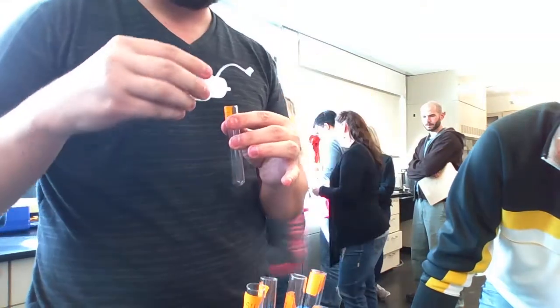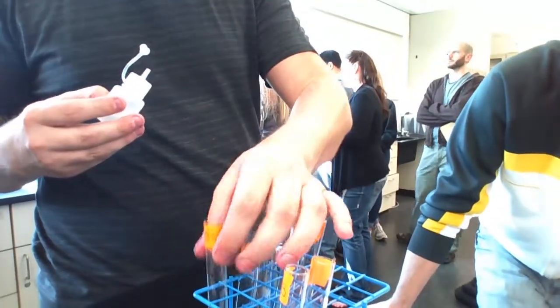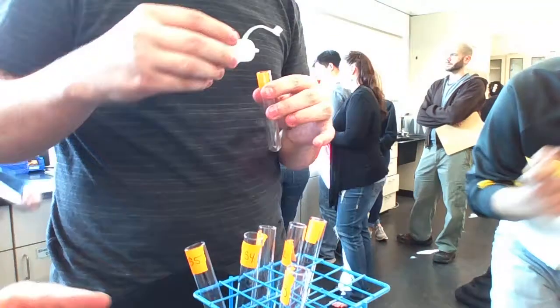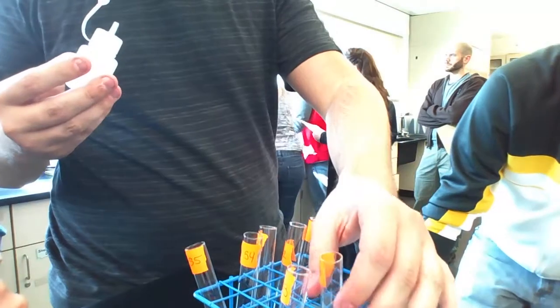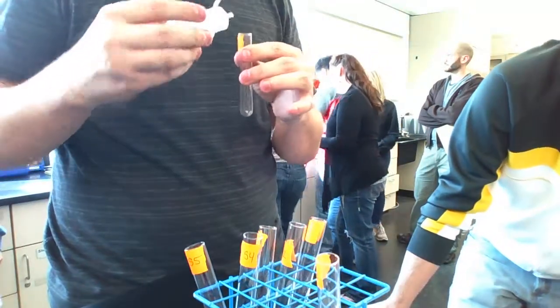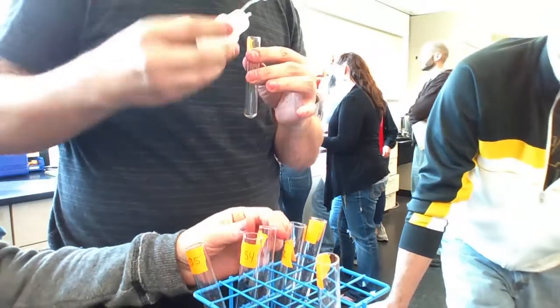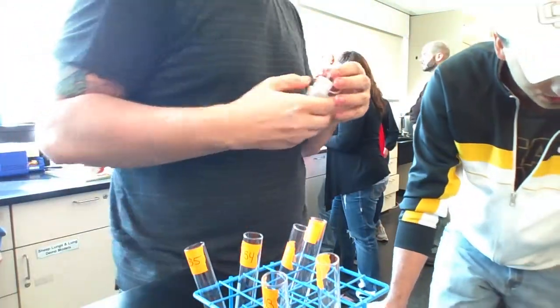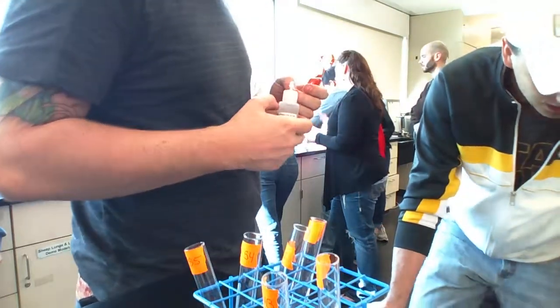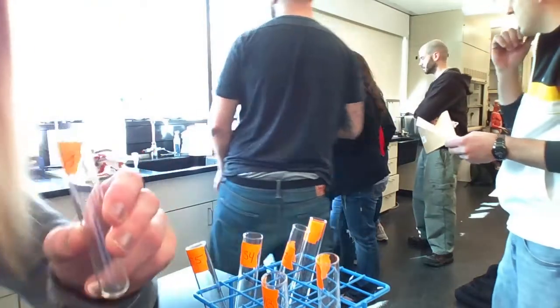And then the seed. So we're putting 5 drops of what? 5 drops of lipase in every tube but tube 2. Sam, you want to take tube 3 and boil it? For 4 minutes. Okay, so now we need litmus cream. So we're boiling 3 for 4 minutes.